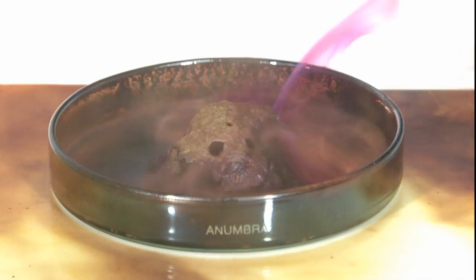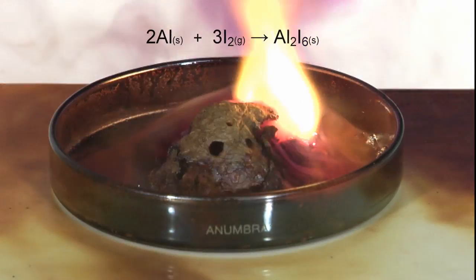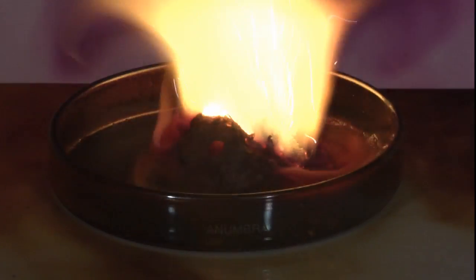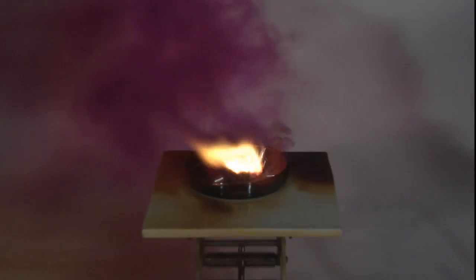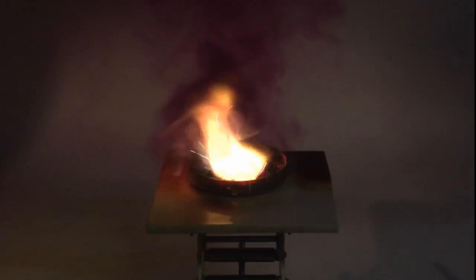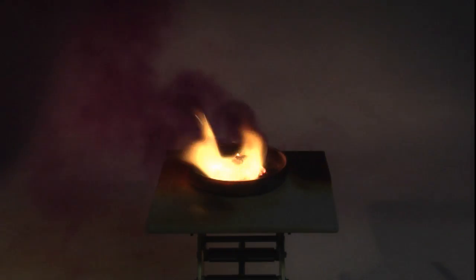The reaction forms hydrogen iodide in addition to the product aluminium iodide, and the high temperature causes iodine to sublime, producing the purple fumes. If the cooled product is added to water, an acidic solution is formed.